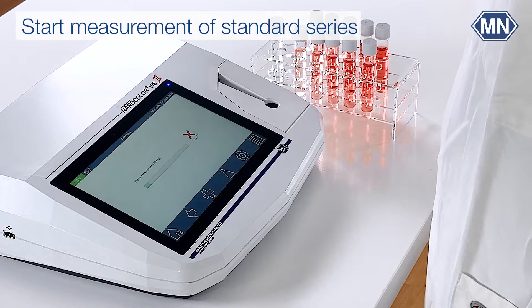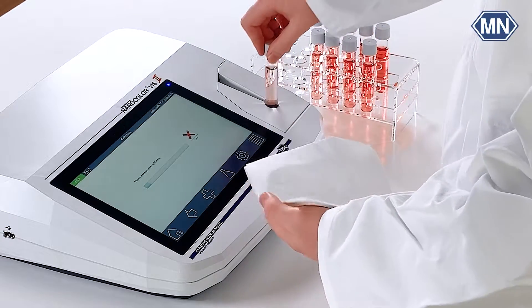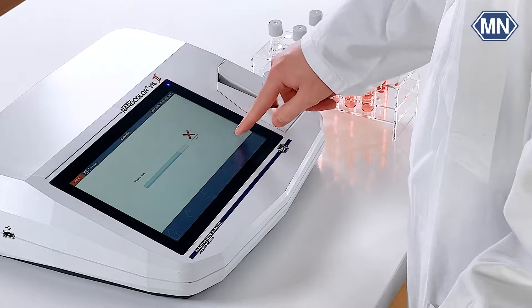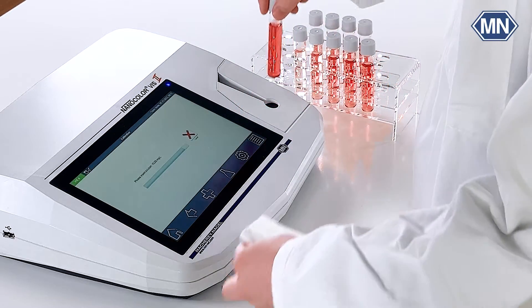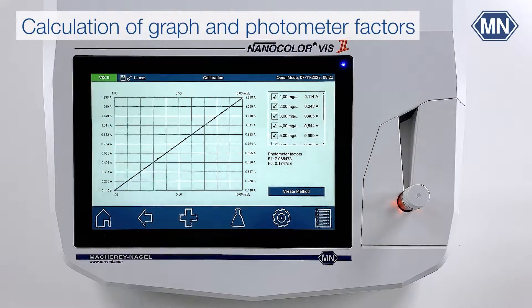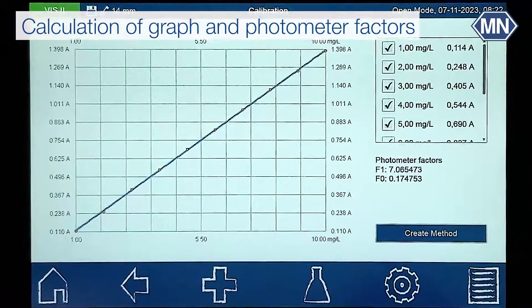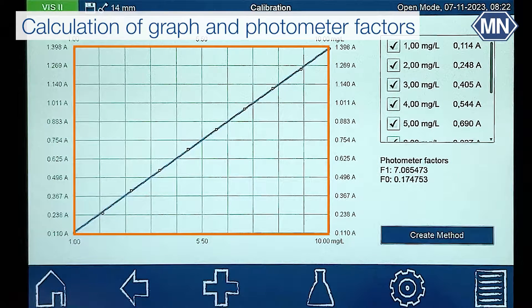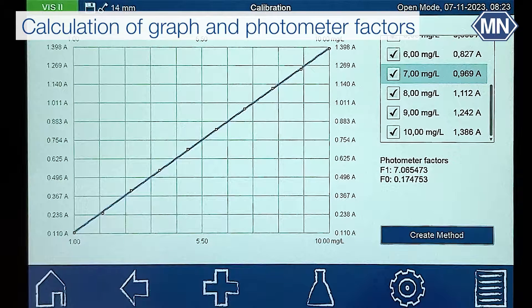Follow the on-screen instructions. After the last measurement of the standard series, the photometer will automatically calculate the photometer factors depending on your input and display the respective calibration curve on screen. The blue lines show the confidence interval of your method. All concentration-absorbance pairs are displayed in a table.